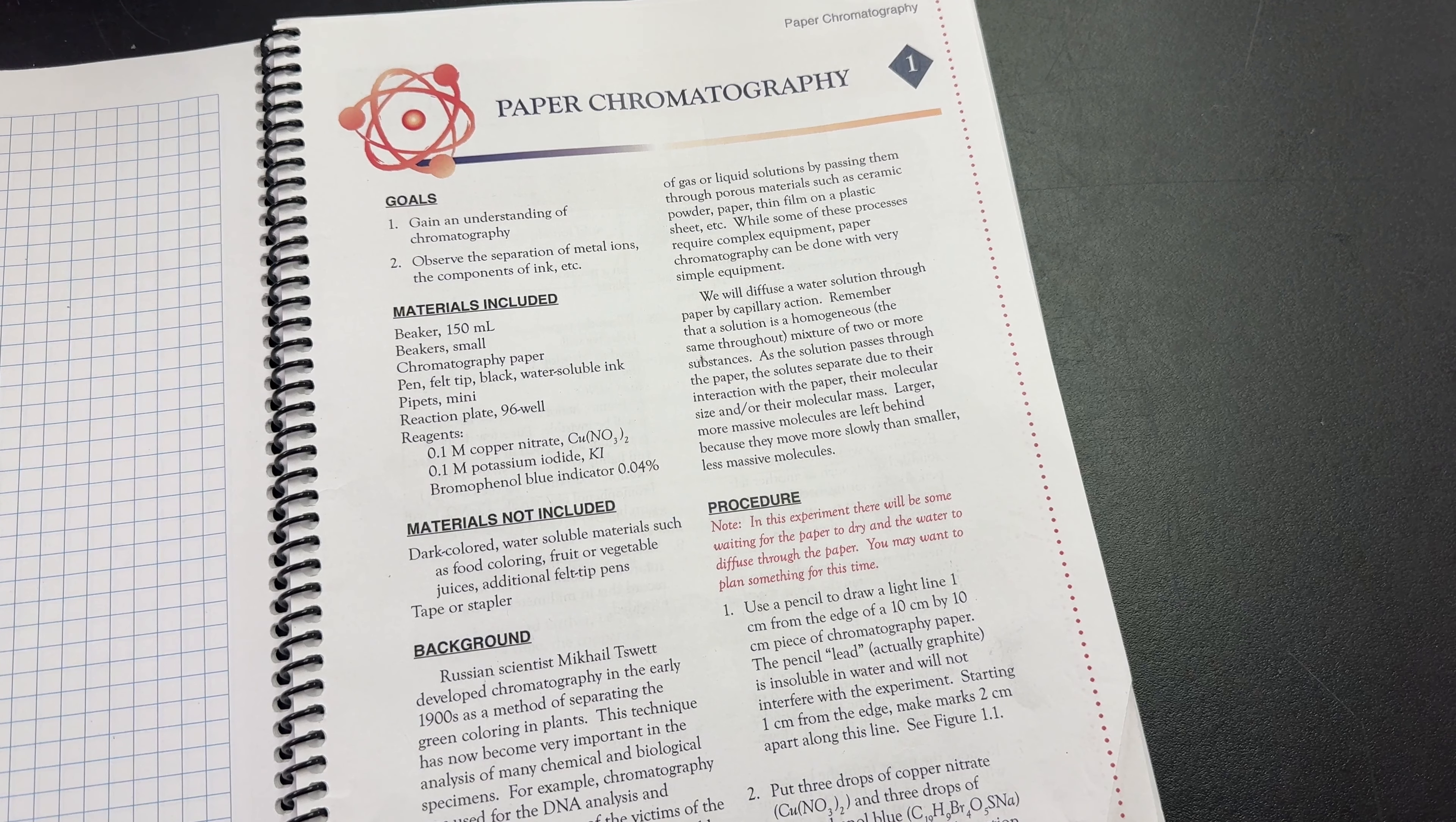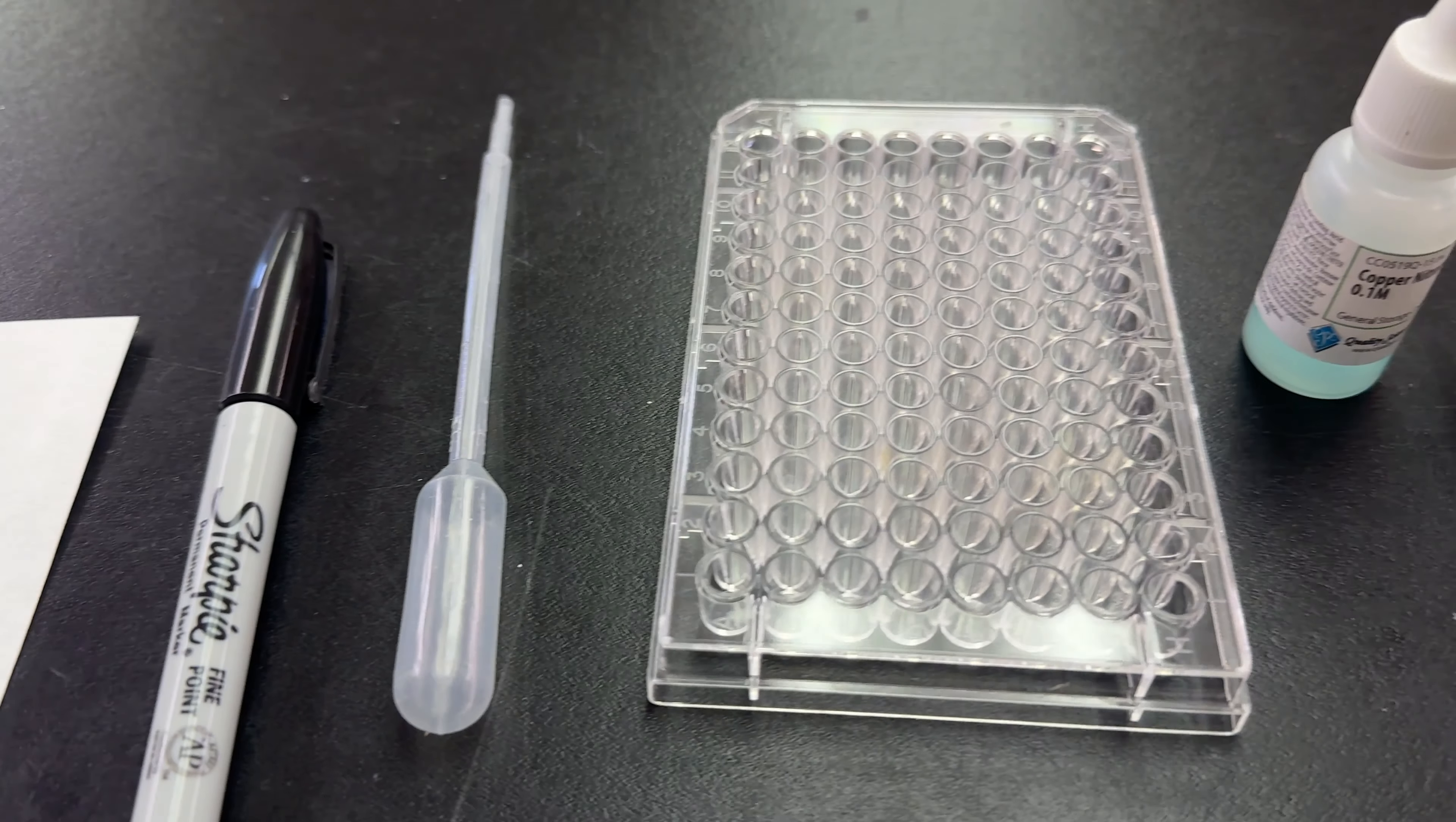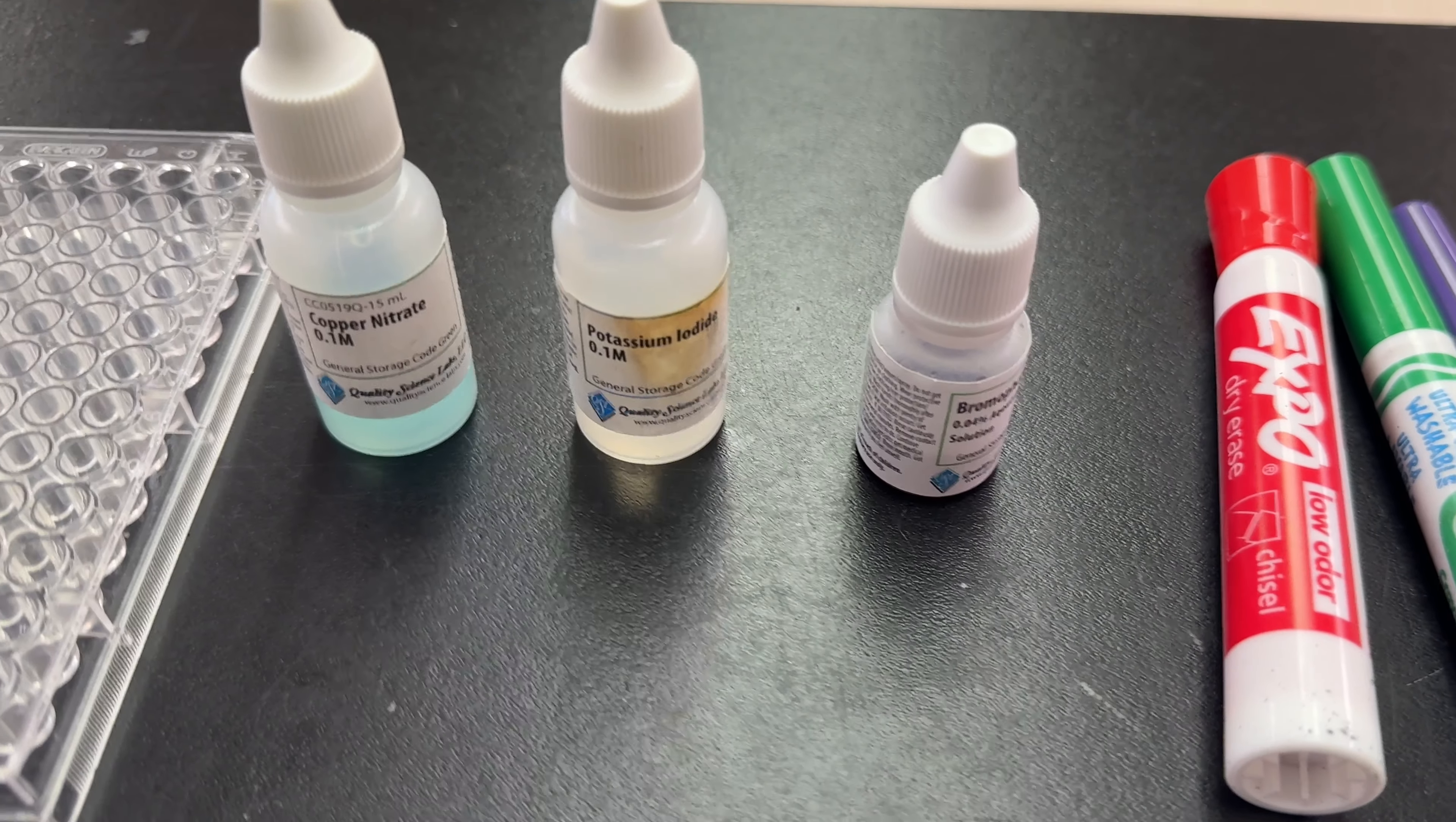The goals of this lab are to gain an understanding of chromatography and to observe the separation of metal ions, the components of ink, etc. For this lab you will need a beaker, 150 milliliters, a small beaker, chromatography paper, a felt tip pen, pipette, reaction plate 96-well. You're also going to need some copper nitrate, potassium iodide, and bromophenol blue.